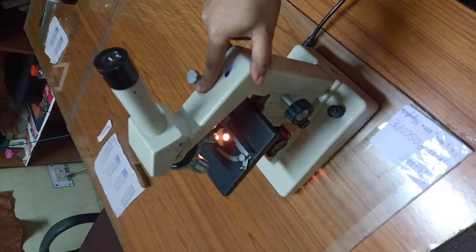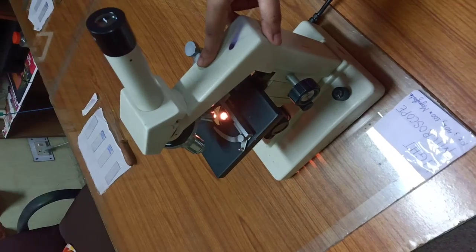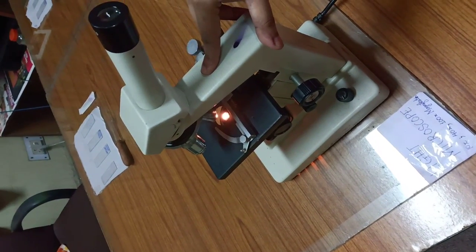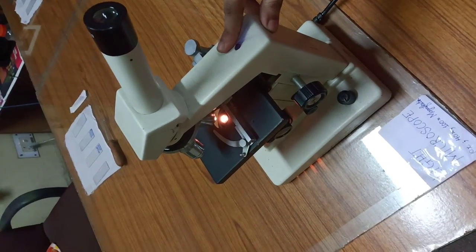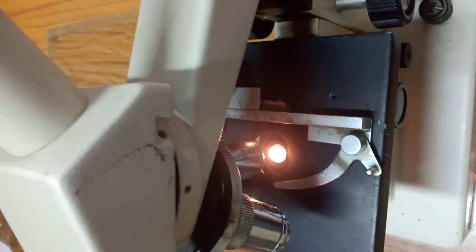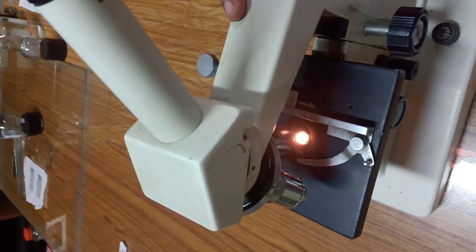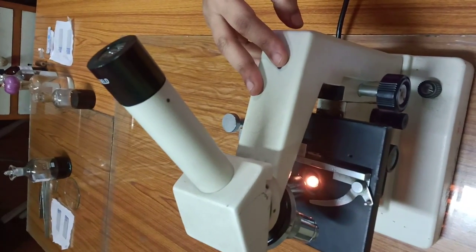Okay, that is the microscopic view that is required to see the objects that cannot be visible by the naked eye. The optical microscope is also referred to as a light microscope. Light, because you see the illumination source is light. Now, this is a type of microscope that commonly uses visible light and a system of lenses to generate magnified images of small objects.